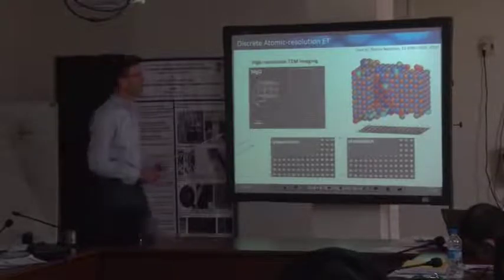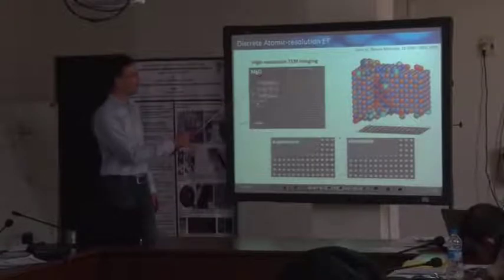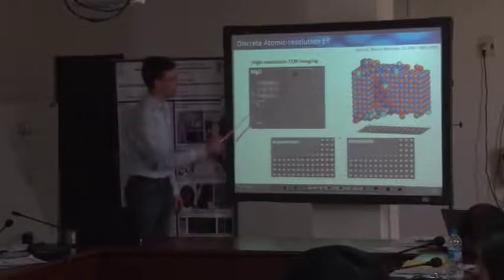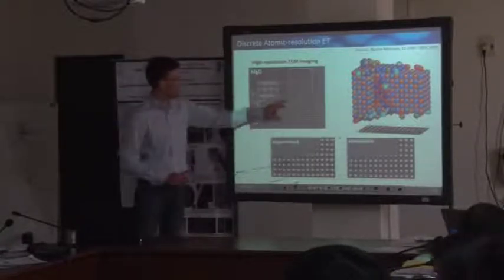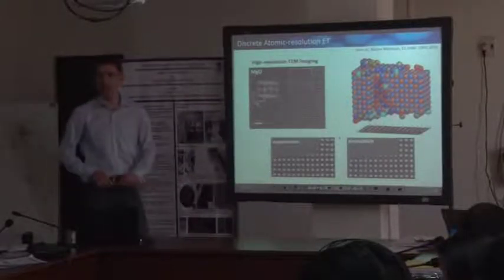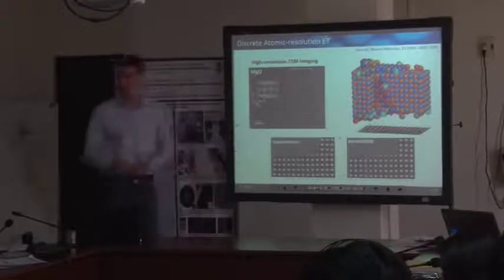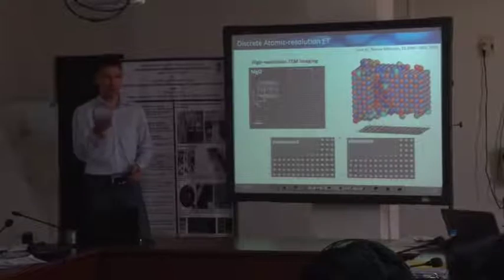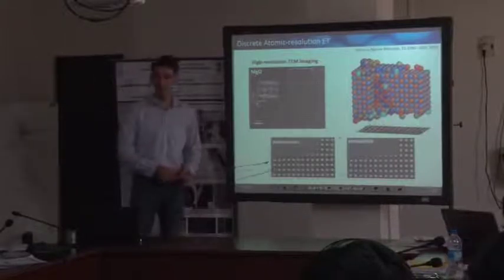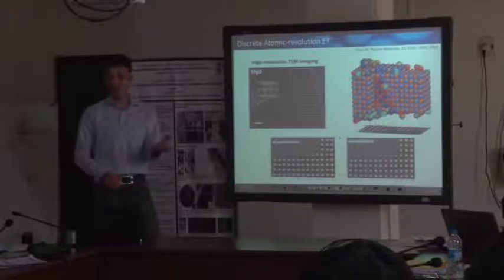I mean, this is an aberration corrected micrograph of a magnesium oxide crystal, where you see all these edges. And you see that there are intensity variations. But based on the assumption that all these atoms are the same, you know that the local phase shift depends on the number of atoms along this atomic column.